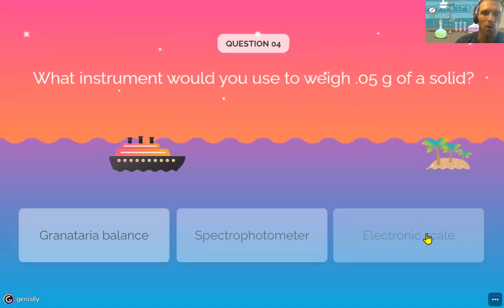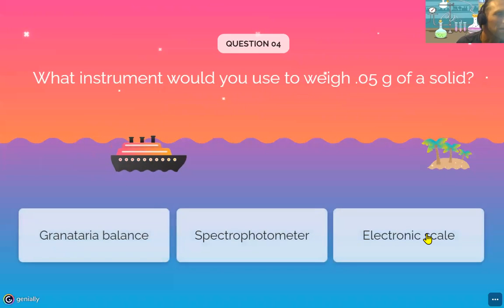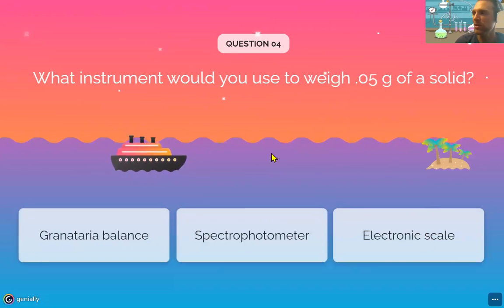Also, in the laboratory, it doesn't matter if you're a chemist or a biologist, the smaller the volume, the bigger the impact. If you have to deal with small volumes, the risk of having a mistake is higher, because it's really more difficult to manipulate and to handle very small quantities than large quantities. So that's why these pipettes are very precise, and sometimes, especially in genetics and in medical investigation, the volume is very, very important.